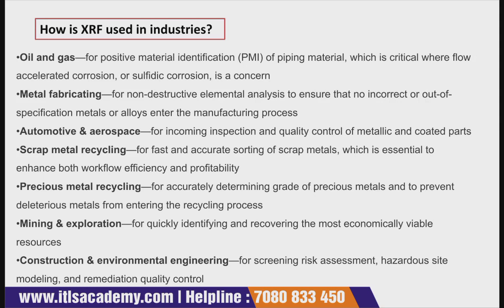And in scrap metal recycling, for the fast and accurate sorting of scrap material, which is essential to enhance both workflow efficiency and profitability, this analytical technique is used. Then in mining and exploration, for quickly identifying and recovering the most economically viable resources, this technique is used. Then it has an application in construction and environmental engineering, for screening, risk assessment, hazardous site modeling, remediation, and quality control.